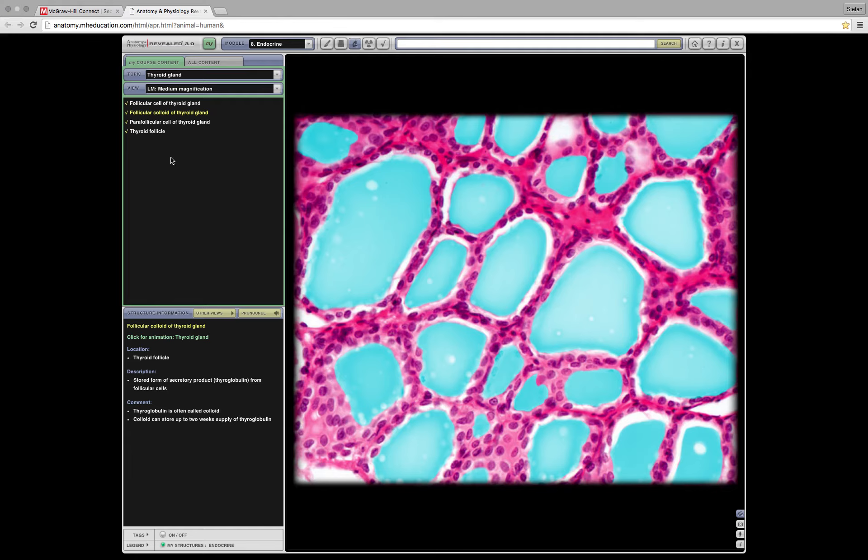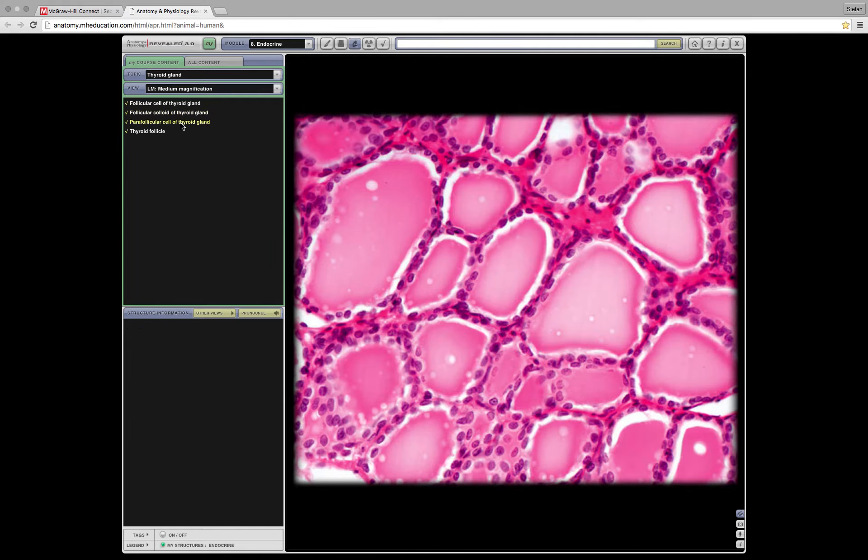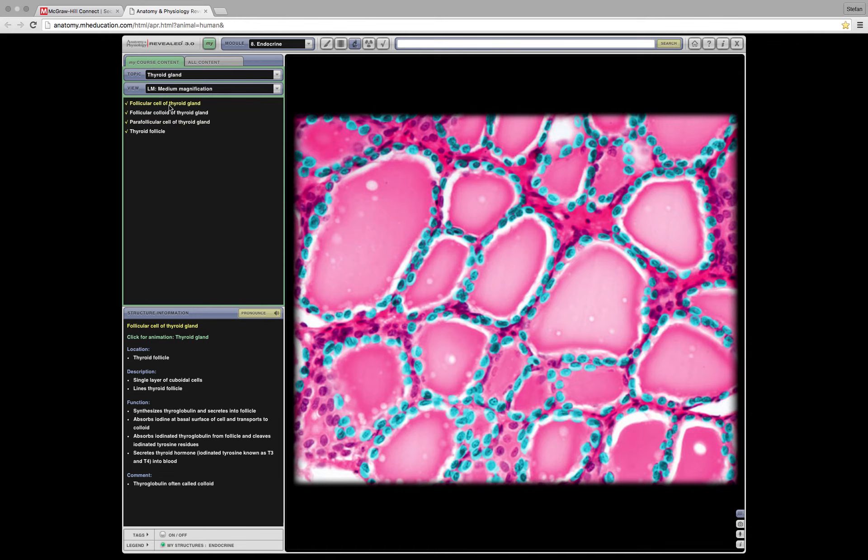And then the parafollicular cells. Those are the cells sort of interstitial in between the circles there. And just a quick refresher, the follicle cells, the cells that surround the perimeter, they secrete thyroid hormones, T3 and T4.